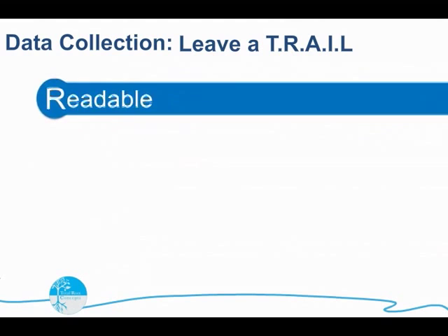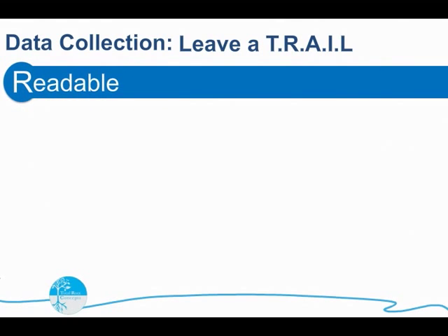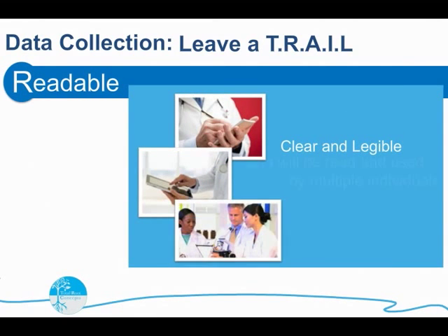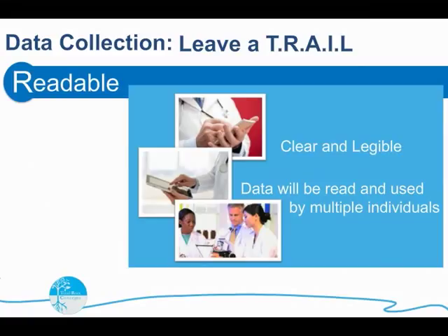While the next quality of data collection is one of the easiest to remember, it is also one of the most common mistakes. Make sure to be neat. Your data will be used again. If people can't read it, what was the point of recording it in the first place?